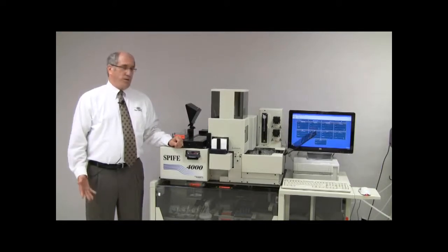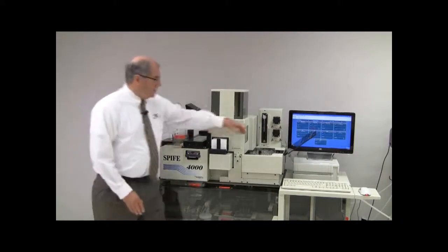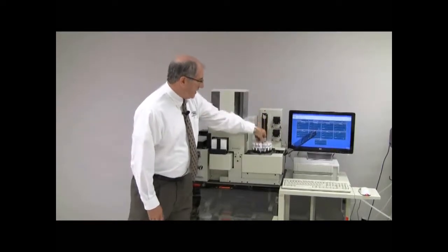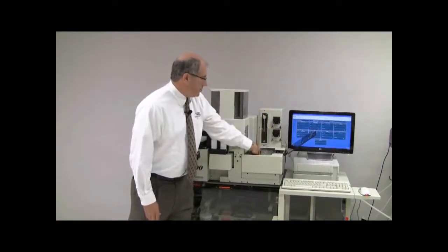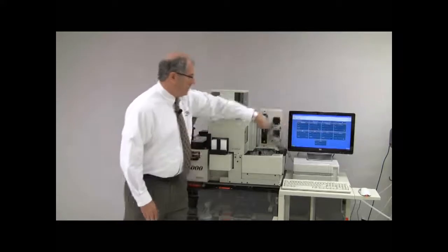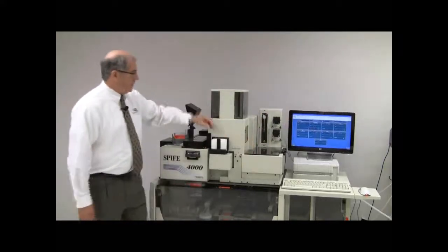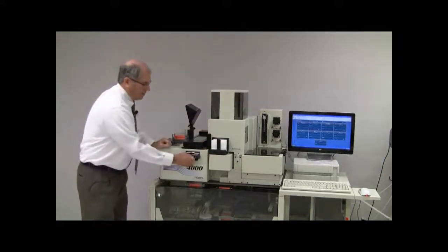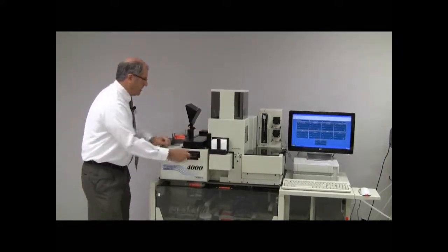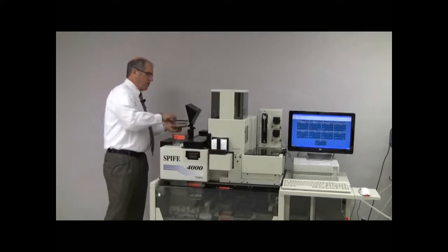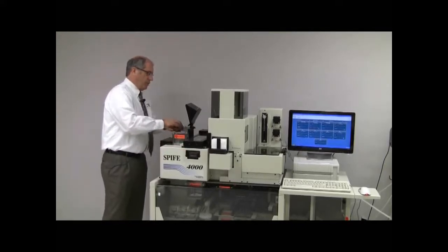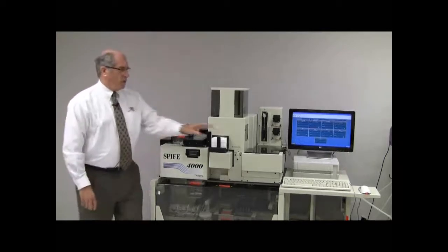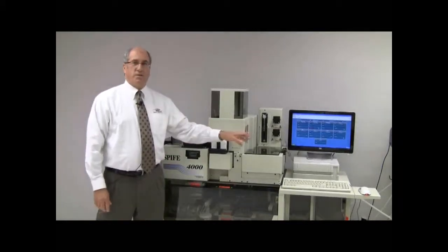The operation is very simple. The operator loads the sample tubes into the carousel, places the carousel onto the turntable, closes the cover, loads sample trays into the holder, loads blades into the holder, closes that up, and loads the gels into what we call a humidor, closes the cover, walks over here, and simply presses the start button.